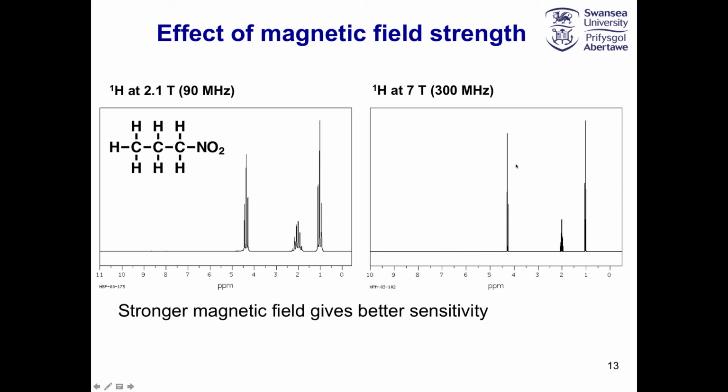The peaks are taller, you can't tell very well here as both spectra are so good, but the noise level in the baseline is much lower in this spectrum, allowing us in principle to use smaller amounts of sample to get equivalent results. This means that the instrument is more sensitive. The peaks are also narrower, and you can clearly see that the splitting is tighter.